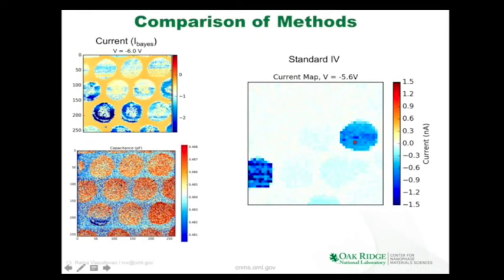Okay. In addition to the current, we can also extract the capacitance and we can plot the capacitance. And very interestingly, of course, our capacitance values are larger on the capacitor because capacitance scales with contact area. So this is again why we can't just use a basic reference measurement to subtract the capacitance from the measuring circuit, because the capacitance can vary across the sample. And because you have your tip-sample capacitance which is varying, it's very hard for you to come up with a very nice reference measurement to be able to infer what the capacitance should actually be.